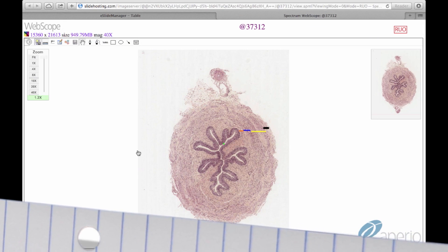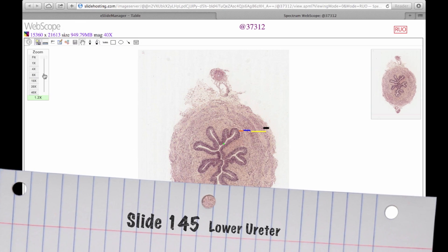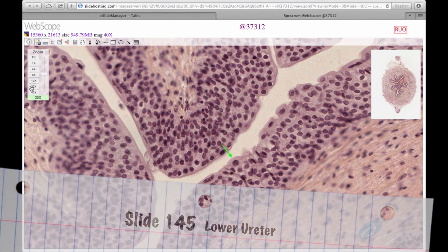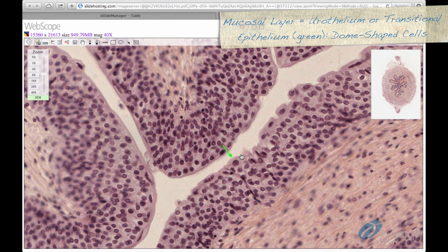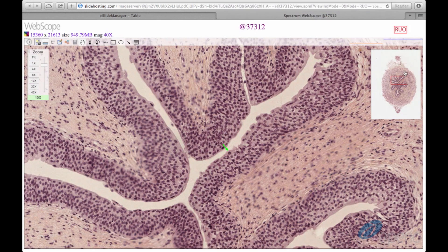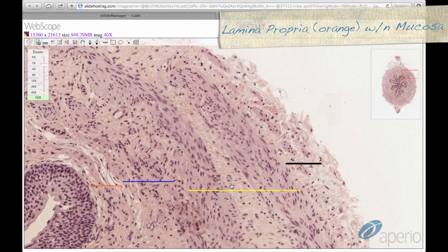Slide 145 is a section of the lower ureter stained with H&E. The mucosal layer of the ureter consists of transitional epithelium, seen here at the green arrow, which is a key identifying characteristic of urinary epithelium. Recall that urothelium consists of dome or umbrella shaped cells. Additionally, we can find the lamina propria in the mucosa, spanned by the orange line.